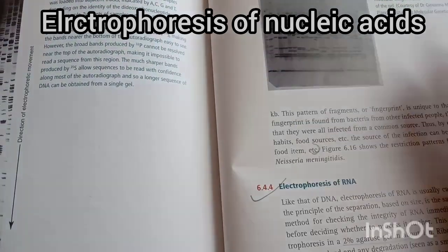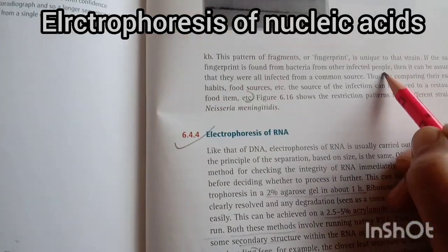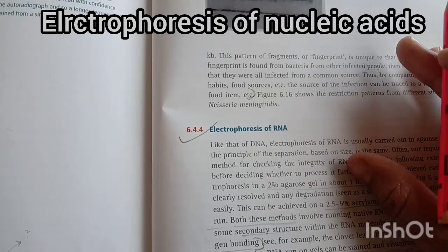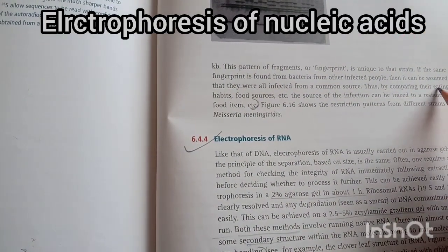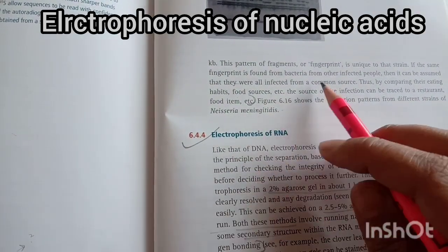The pattern of fragments, or we can say the fingerprint, is unique to that strain. If the same fingerprint is found in bacteria from other infected people, then it can be assumed that those people were infected by the same Salmonella bacterium. By comparing their eating habits and food sources, the source of infection can be tracked to a restaurant food item.